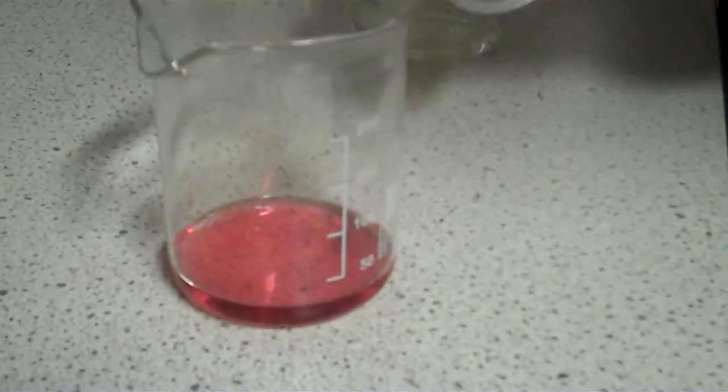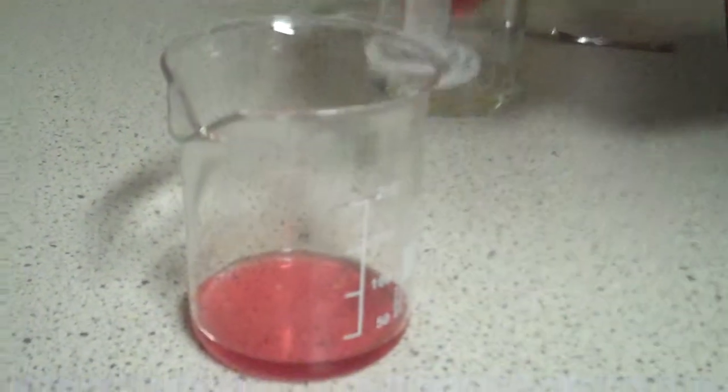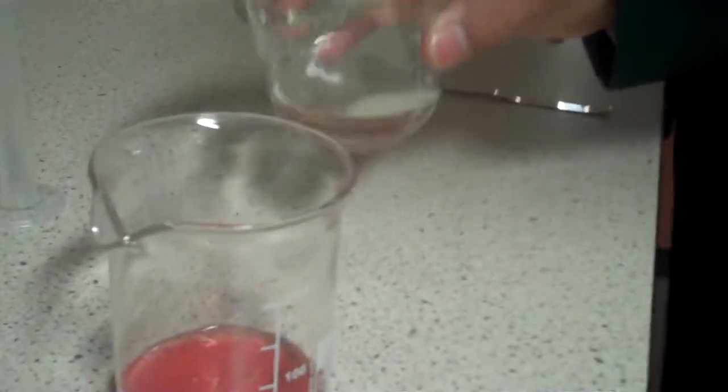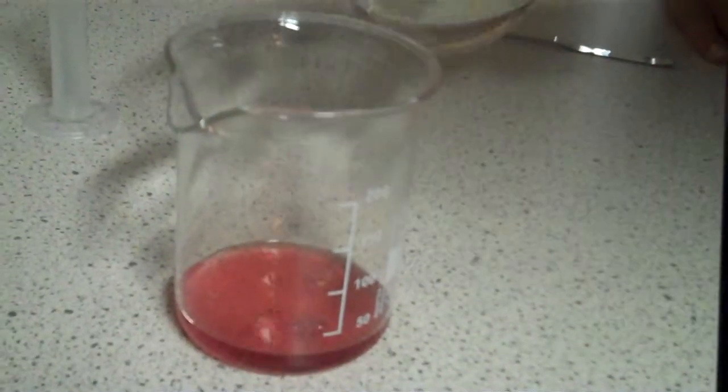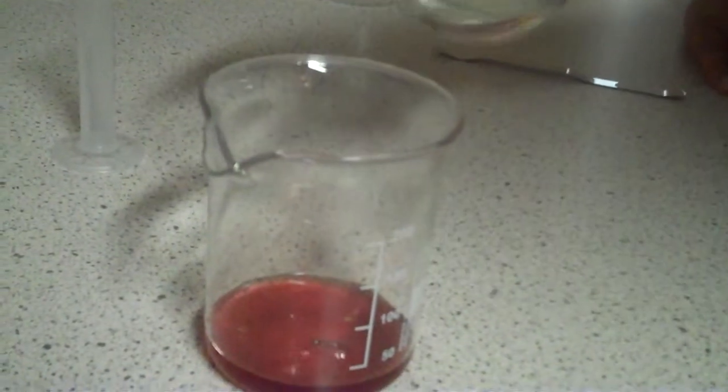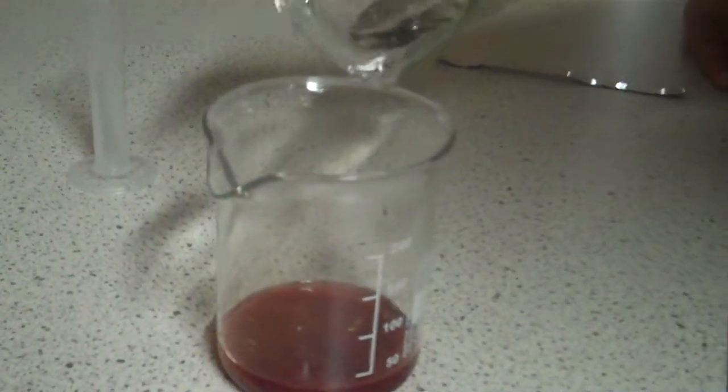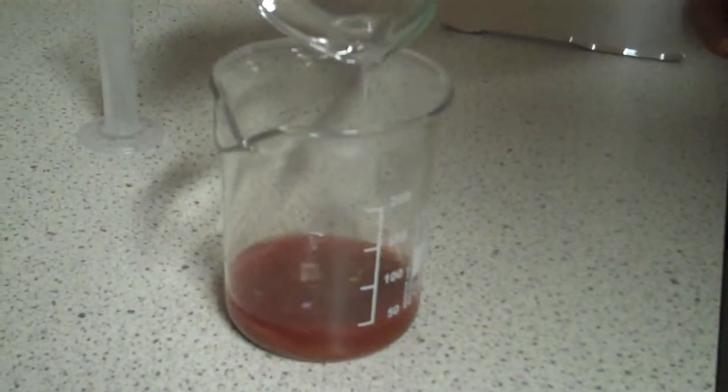Firstly what we do is add the acetic acid into the first beaker. Then we add the 8 grams of potassium nitrite solution slowly into the first beaker. And finally we filter it off.